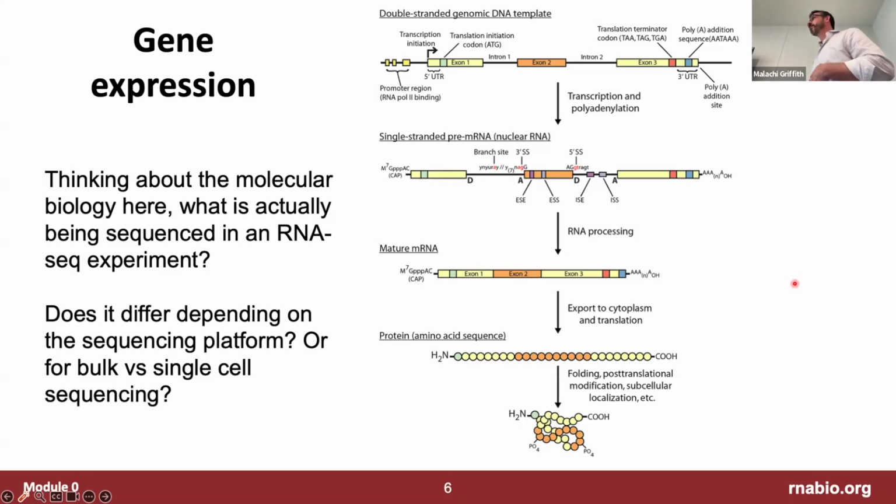Yes, probably no fragmentation of the RNA transcripts. Right, exactly. So we're not sequencing the whole mature mRNA from end to end, and we're not getting additional modifications, like things that are methylated. We're basically converting it to cDNA, breaking that full-length cDNA into pieces, and then sequencing little chunks. And then we're hoping in the analysis that we can reassemble things or infer things about the whole transcript based on those pieces.